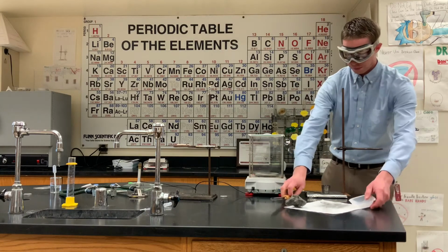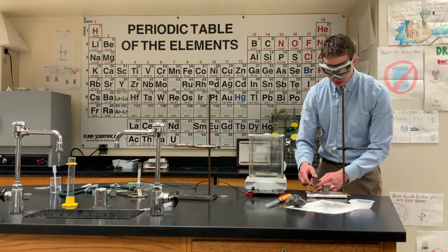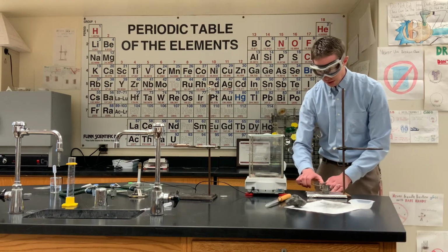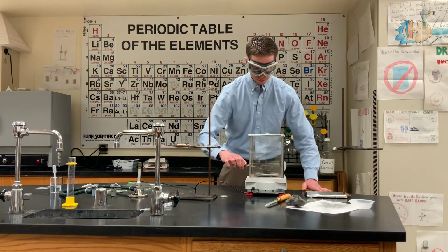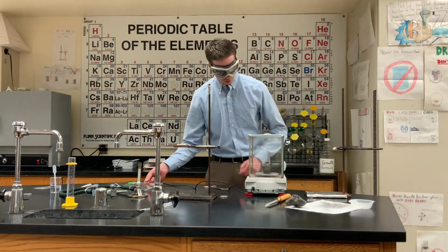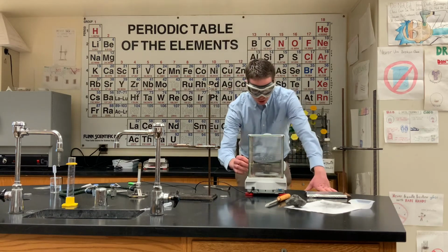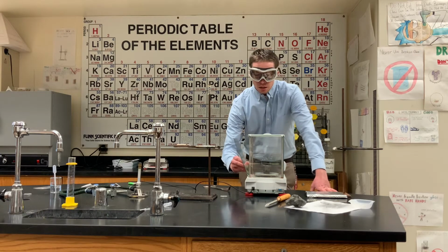There we go. Get the lid back on here, and put it back in the analytical balance. Draft guard back in place. And the final mass is 28.026 grams. All right.